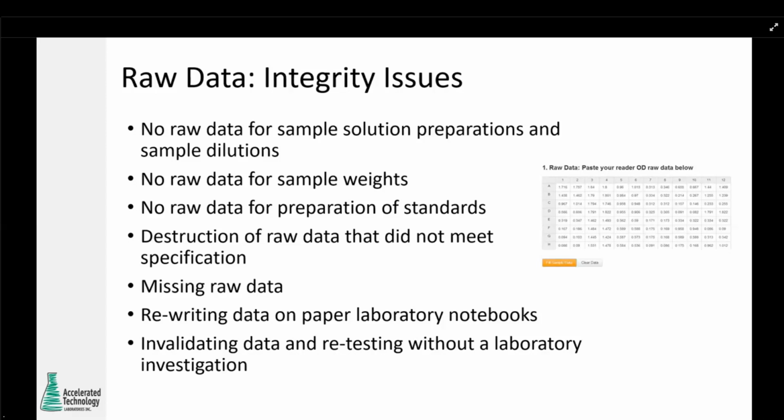It's really important to maintain that traceability trail from all of the components and raw data from the instruments, from the reagents, the supplies in the laboratory, as well as maintaining that certificate of analysis that's basically verifying that that reagent or standard or supply has been tested and is ready for use.